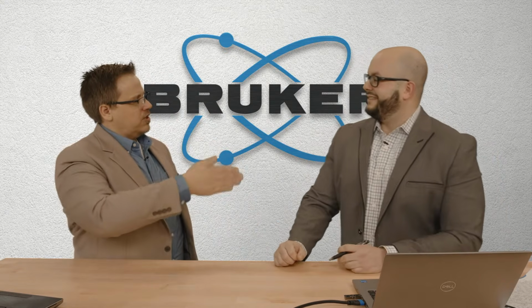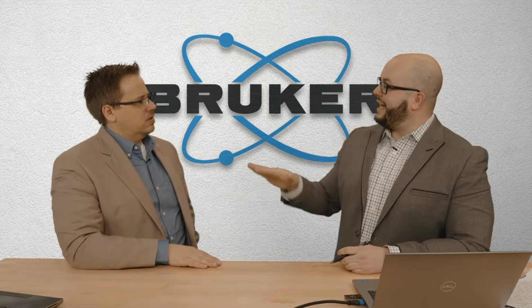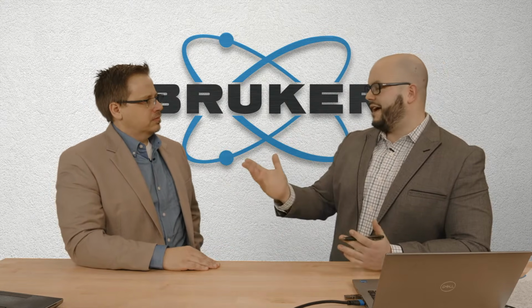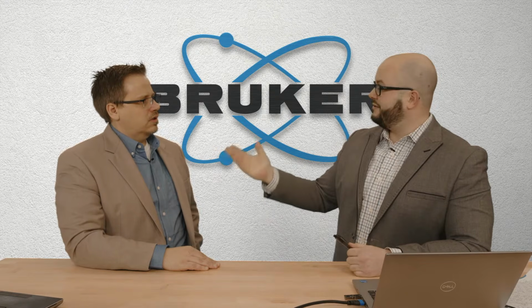Psi or chi. Yeah, chi is normally what we use when we talk about the actual machine, like there's a chi circle. If you have a stage that can tilt the sample out of the diffraction plane, we call that chi or psi. But there's also another way to do the measurement.